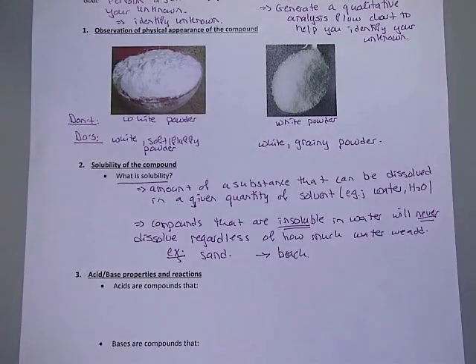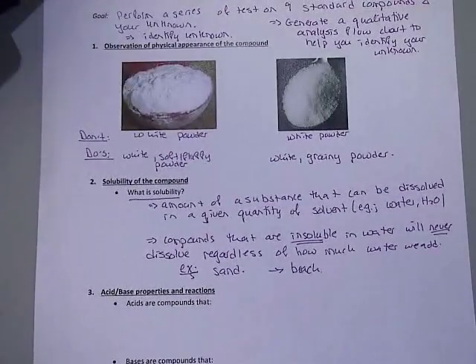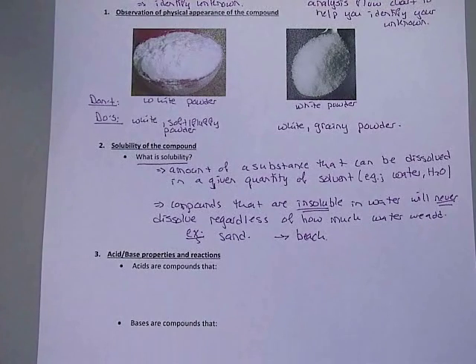The third part of this experiment deals with acid and base properties. This is the introduction of acids and bases. Most of you are going to go on to other courses where acids and bases are very applicable. So this is actually relevant for future courses that you take, as well as this course, of course.